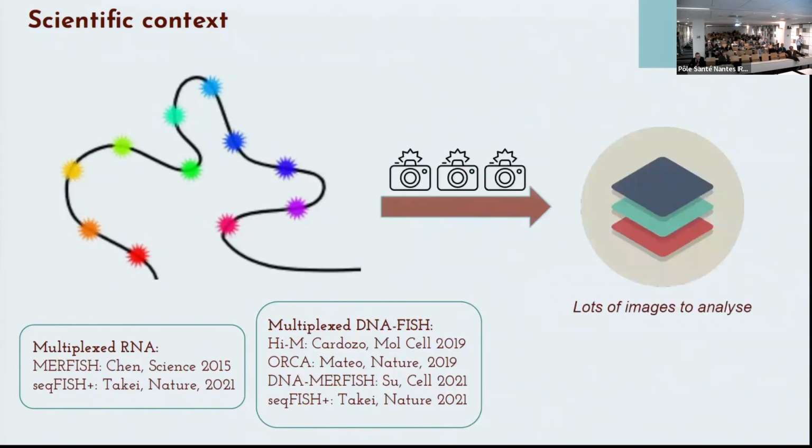But this process generates hundreds or thousands of 3D images, just for one experiment. So developing automatic and robust analysis pipelines is really critical to analyze this data.